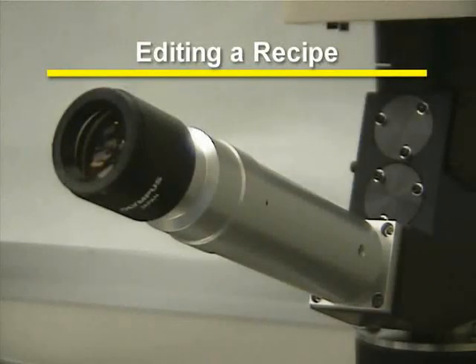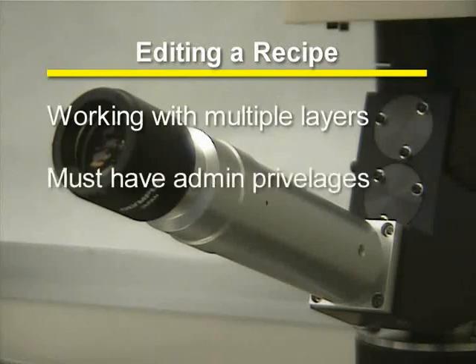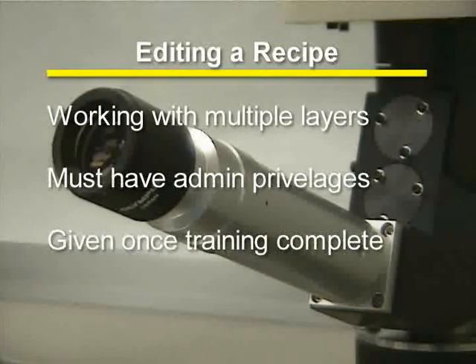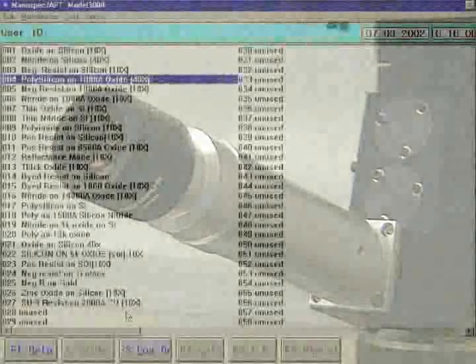Depending on your needs, you might need to edit an existing recipe. This is a common need when working with multiple layers on a silicon substrate. In order to edit a recipe, you need to have administrative privileges. These are given to you once you complete training and are checked out by a trainer. You log on by clicking on Log On from the main screen. After doing so, you will be granted permission to edit or add recipes.